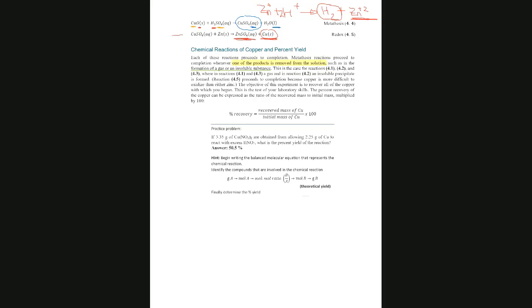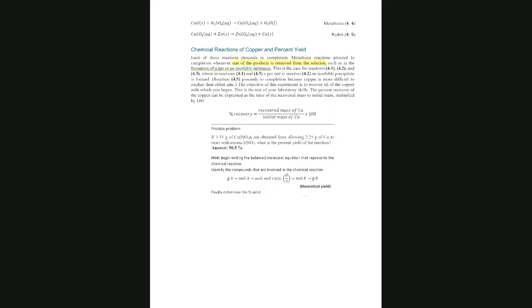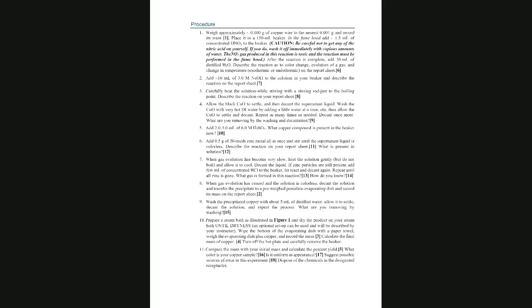Okay, so the last step, if you were in the lab, is you have everything in the beaker. You wash it very well, and then you transfer the solid to an evaporating dish. Let me see if there is a drawing here. Okay, here.